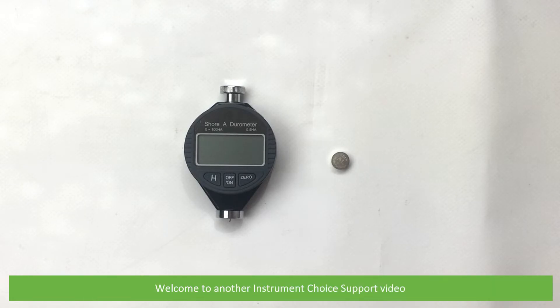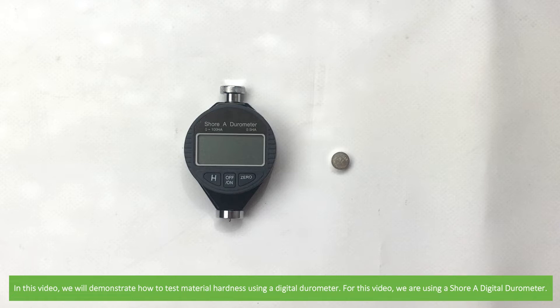Hi and welcome to another Instrument Choice support video. In this video, we'll demonstrate how to test material hardness using a digital durometer. For this video, we are using a Shore A digital durometer.